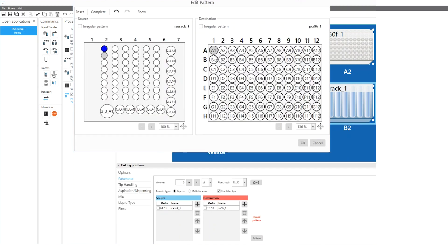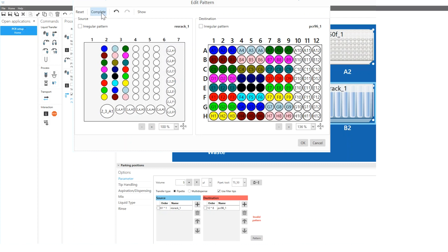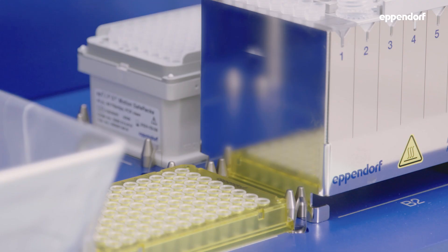You can decide how many technical replicates you would like to create in your PCR plate by selecting multiple wells on the destination labware. For the following samples, the software automatically fills in the wells on the destination labware.